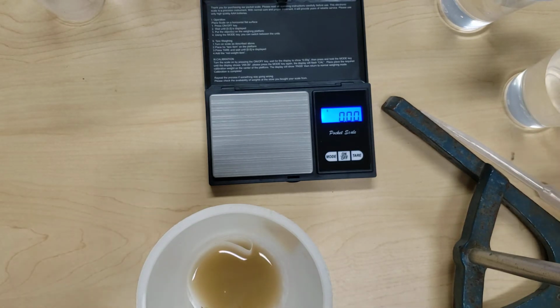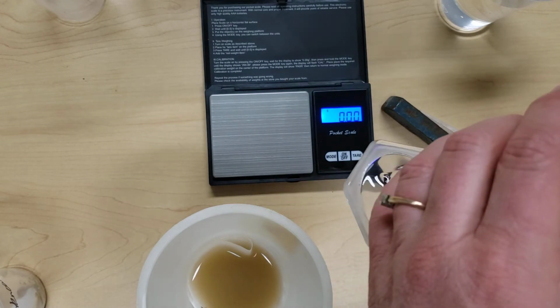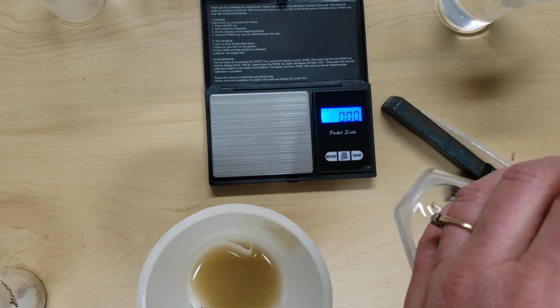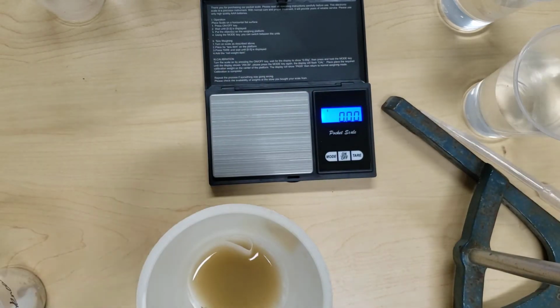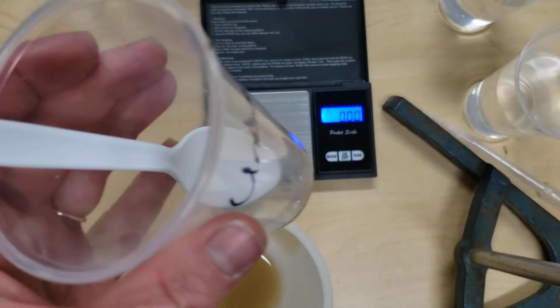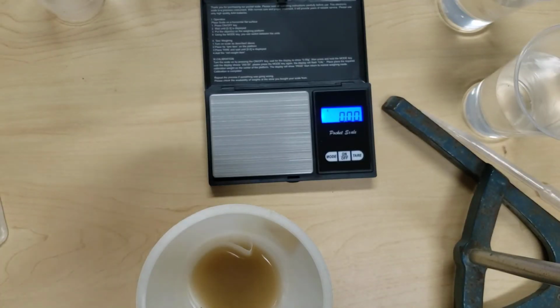Okay, and we're going to take about 5 milliliters of water, and we're going to rinse that container to make sure that we've removed all of the salt out of that original container. So you want to pour it in, swirl it around. Hopefully you've done a better job of removing the sand than I have.